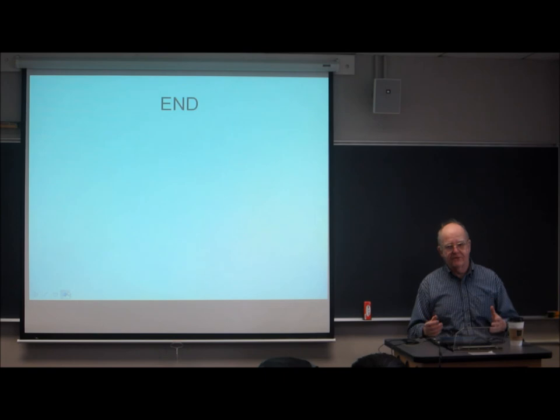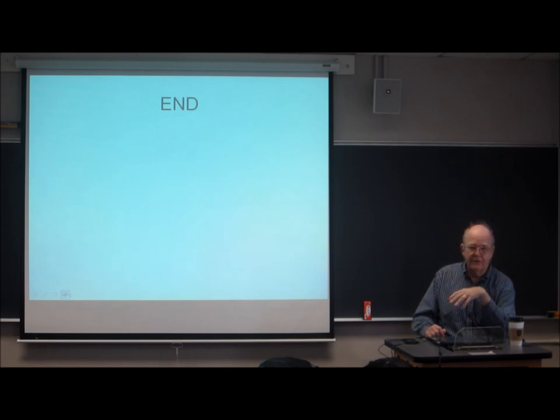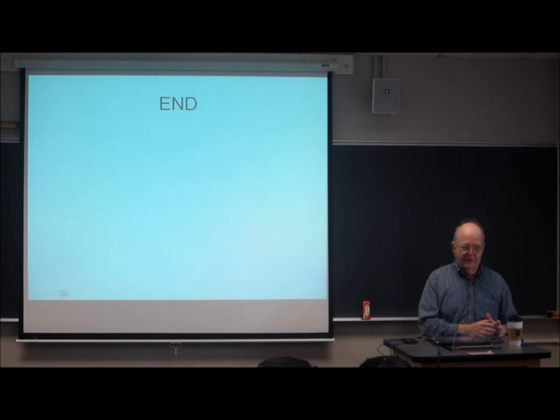Liquid chromatography is a horse of another color. The mobile phase is just as important as the stationary phase, and sometimes more important. So you have to understand what's going on in both phases simultaneously. Furthermore, the mobile phase dissolves into the stationary phase, so in liquid chromatography, when you change the mobile phase, you're also changing the stationary phase. That makes understanding what goes on at least twice as complicated as gas chromatography. So we'll do gas chromatography first. Okay, see you Friday.